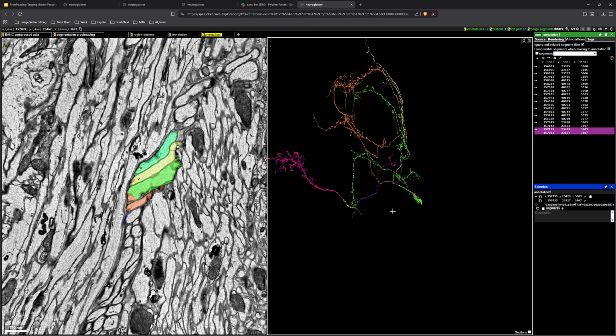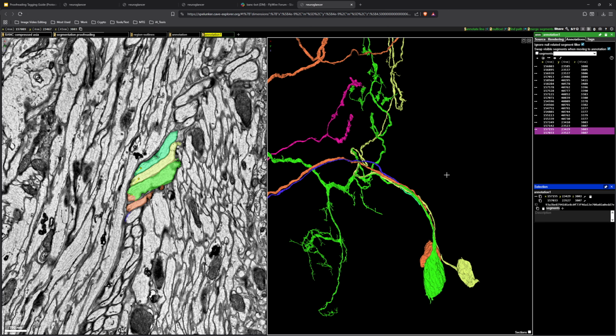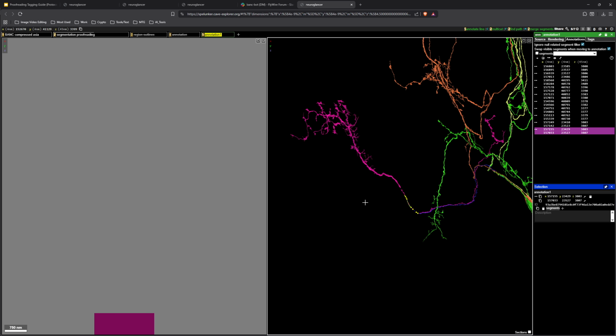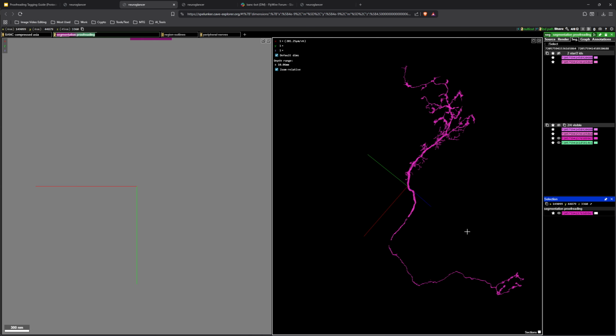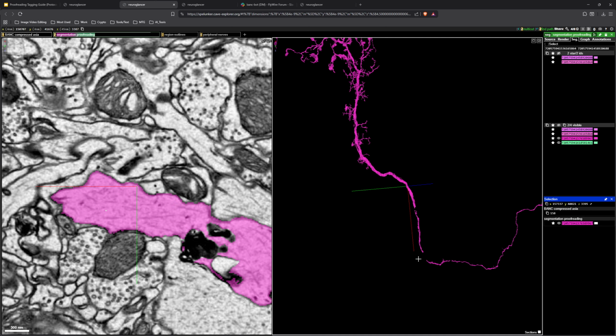Then we have this one. So this one is a cascade change that happens when you do locate the correct path for your soma. So this was that pink one from before, this one over here. And when I look at this, my immediate thought is that the soma tract is somewhere from here to here.